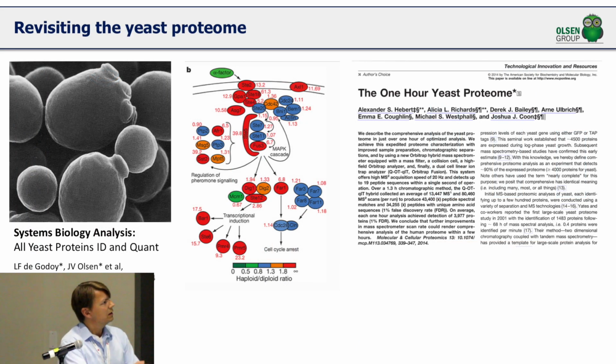We're also interested to see if we can use this system to get close to covering full proteomes, and previously analyzed the yeast proteome in great depth, but that required a lot of fractionation and a lot of analysis time.